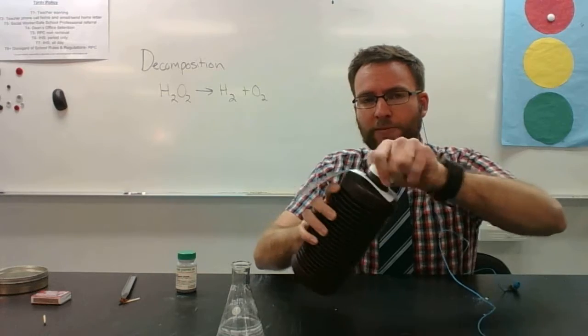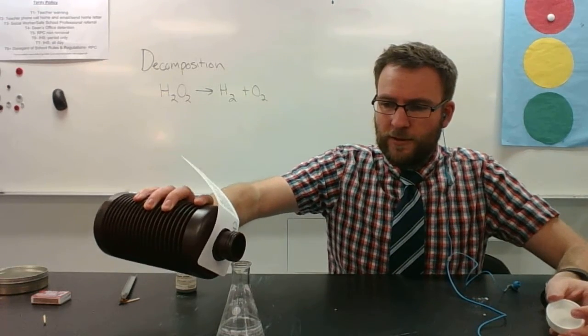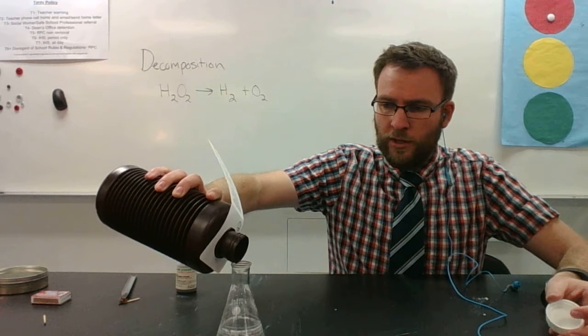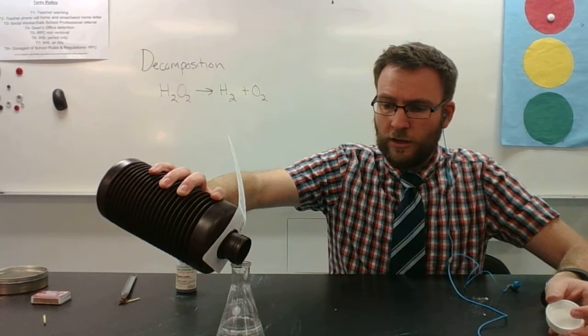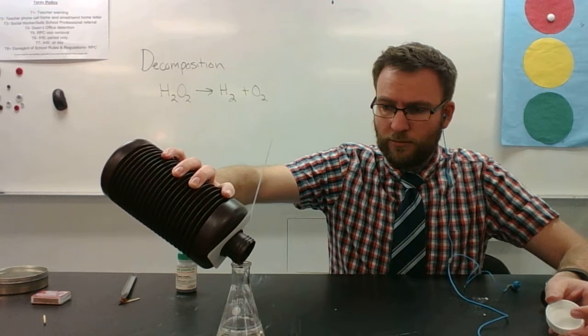Now, the thing about hydrogen peroxide is it actually is usually breaking down on its own. And so even right now, when I pour it in here, the reaction is occurring. But you don't really notice anything because it's not very strong.